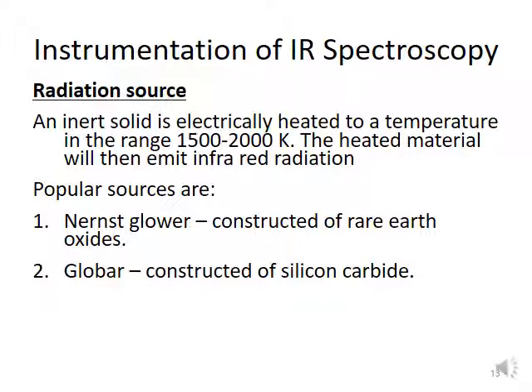The most popular sources are the Nernst glower, which is constructed of rare earth oxides. That is the material used to radiate the infrared.